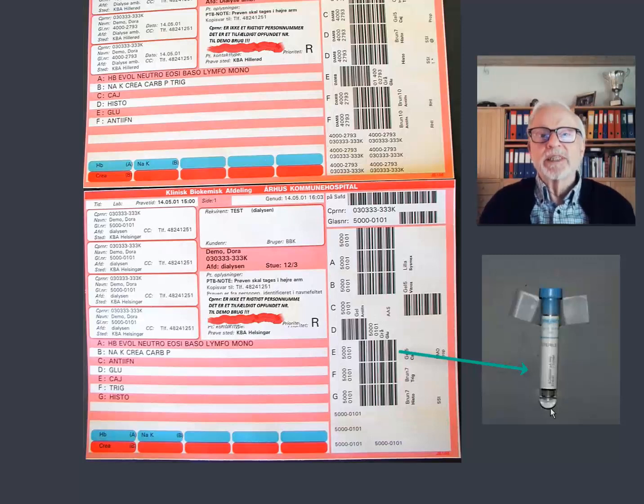When generating the PTB, many different varying conditions had to be taken into account, such as analysis groups, type of test tubes, the laboratory instrument park, configuration, etc. The advantage of printing a PTB for the sampling in question is that it can guide the sampler, and it contains the barcode labels that must be used for the respective sample tube, not a lot of other information.